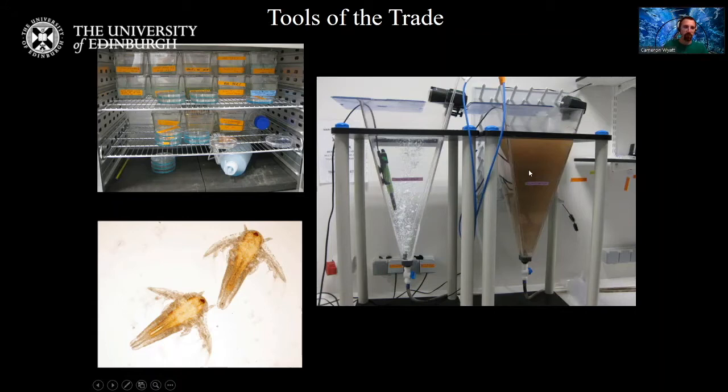And the fish love eating live prey. The zebrafish is a very visual hunter. They use their sight, they use their smell, they like tracking their prey. And they have really big eyes. Their eyes are like a third the size of their brain. So this is a real environmental enrichment, a stimulation for them to hunt down these Artemia and eat them up. But as I say, even the Artemia themselves are interesting because the cysts that they come from can dry out and remain in the soil, the silt, for 100 years, and then you add the water, and they immediately burst back into life.